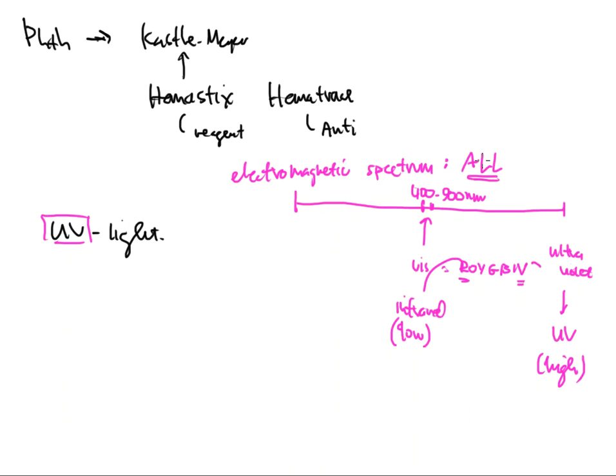That number is very wishy-washy because we're very uncertain of where this goes after 900 nanometers into the infrared. That's kind of where we start to go at that point. And I've written this kind of backwards, so just be careful. But 400 to 900 is typically where our visible is going to be.